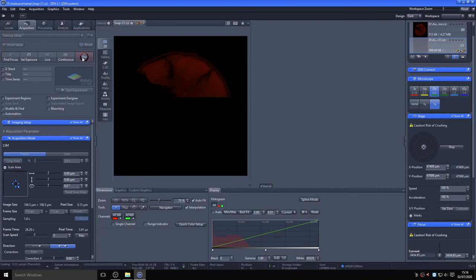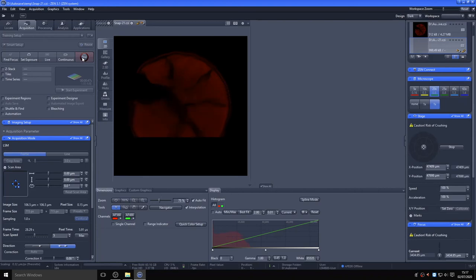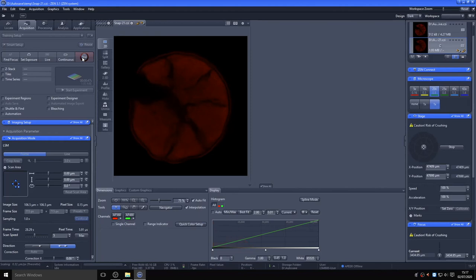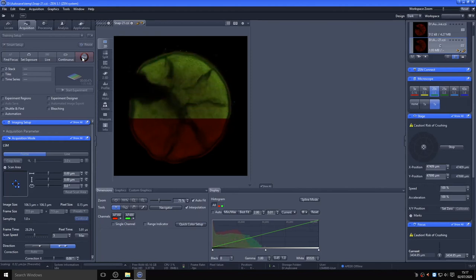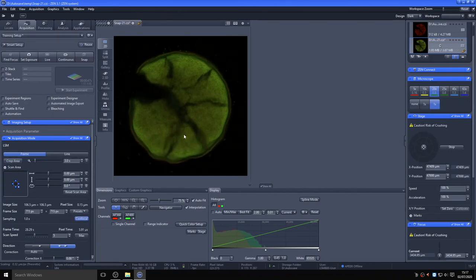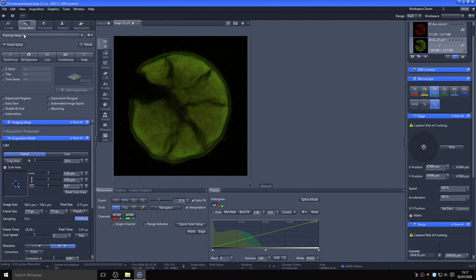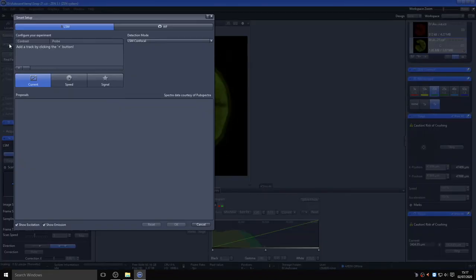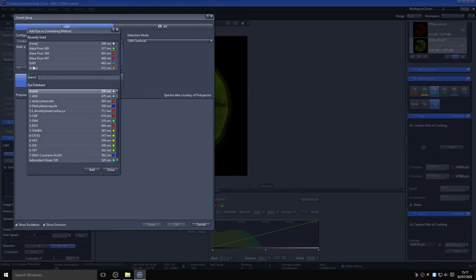I will take a high-quality confocal image of this pollen grain at maximum resolution in two colors, applying some averaging. If I now go back into smart setup and select the same 488 and 568 channels, but this time instead of using confocal, I select the option of Aryscan super-resolution imaging.